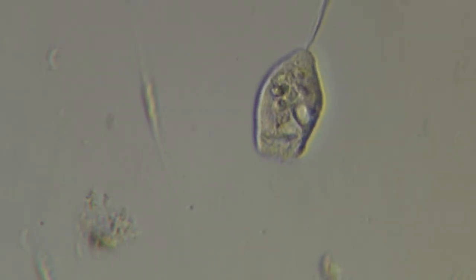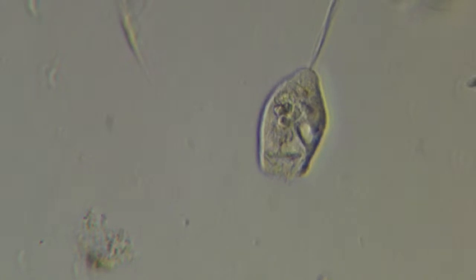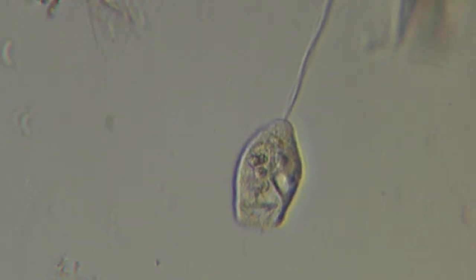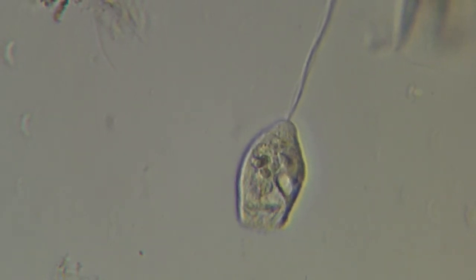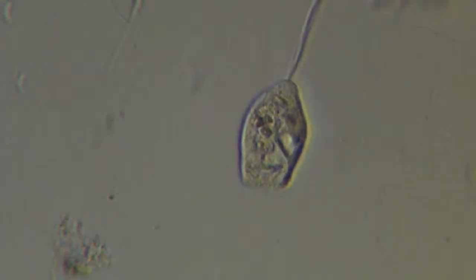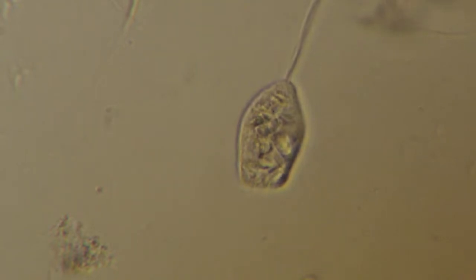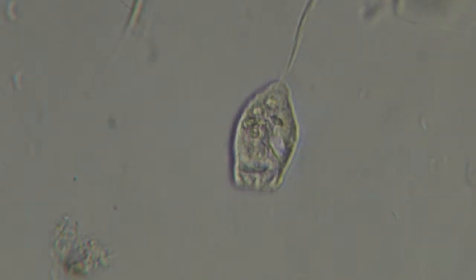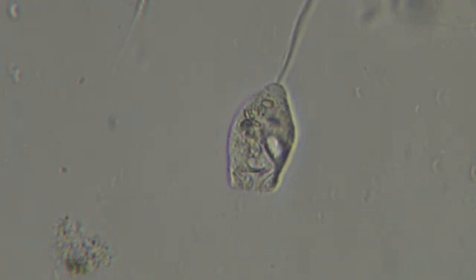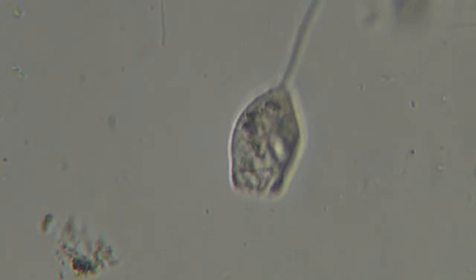And they're interesting because that stalk, when they get annoyed from something, could be any number of stimuli, they will retract in protection, and that little stalk forms a little helix. It just pulls in like a spring, and then slowly relaxes to let them go out to the full length. But see all the stuff flying by that's not swimming? There's some little particles. Change the light level sometimes to really see the particles, but any little fragments flying around are all caused by them, the little current they're creating. Everything else is free swimming in the area. But you can see this movement inside the cell because they're actively moving those cilia.